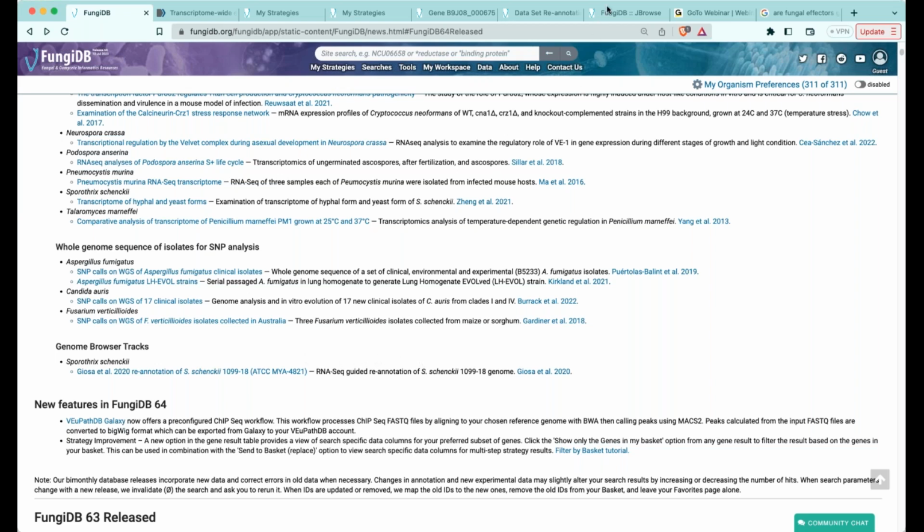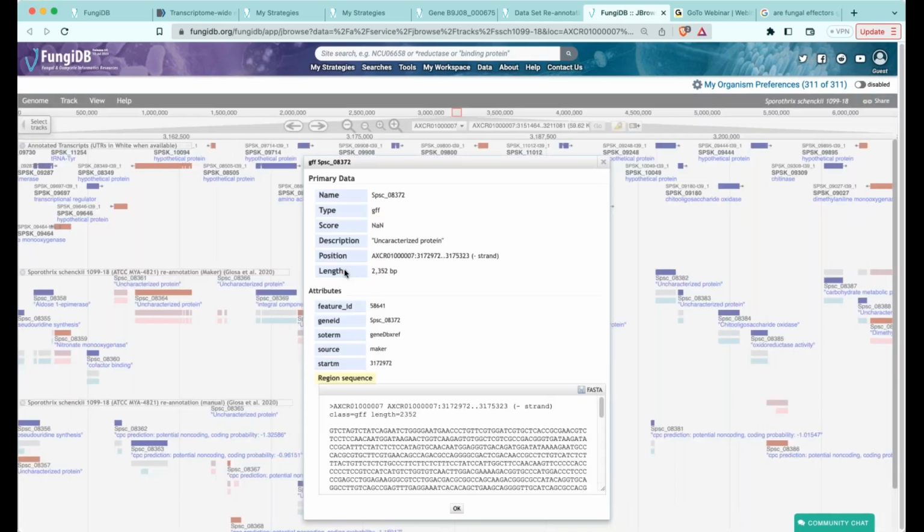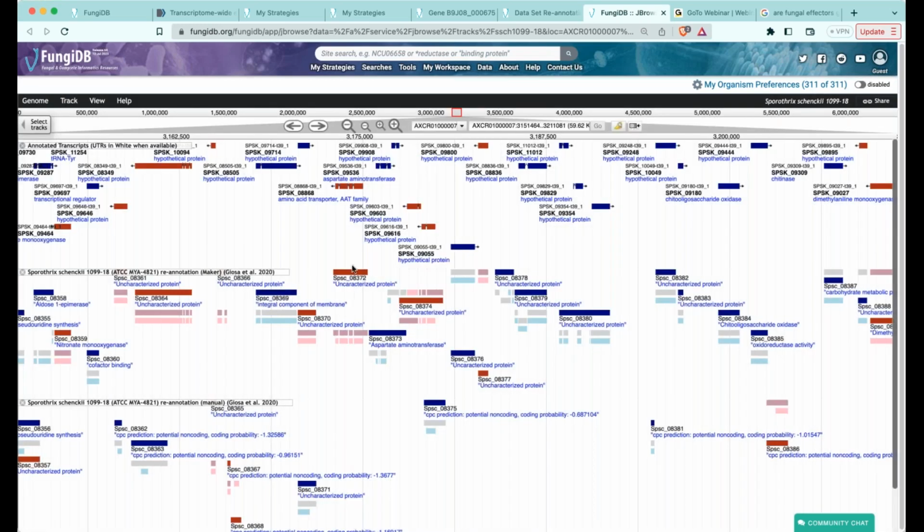We're providing this data set as a genome browser track where genes shown in dark red or blue are the genes that match the description, such as genes in terms of the classes, and additional annotations such as CDS or exons are provided in lighter shaded tones.